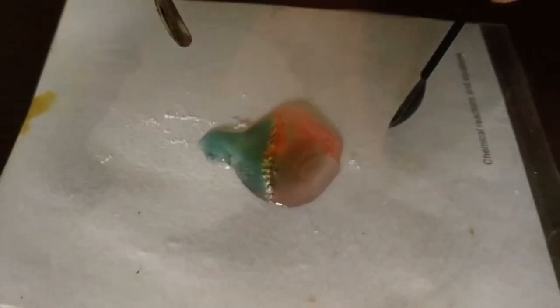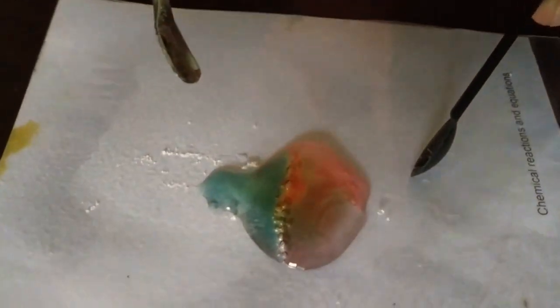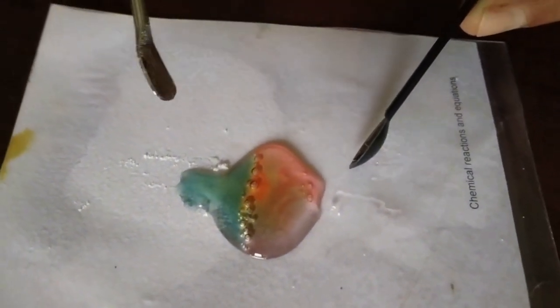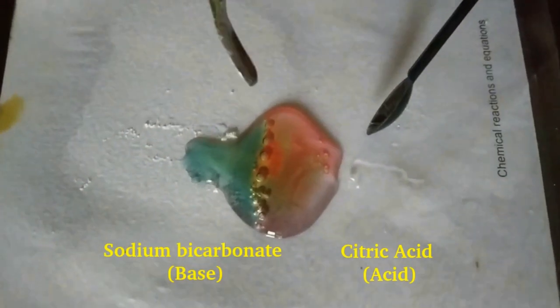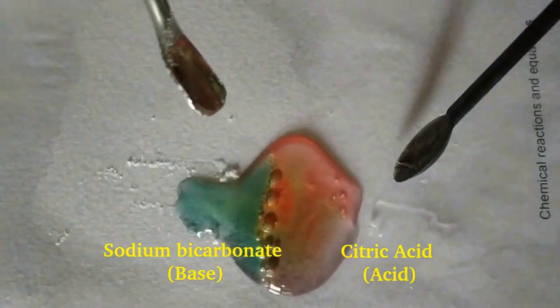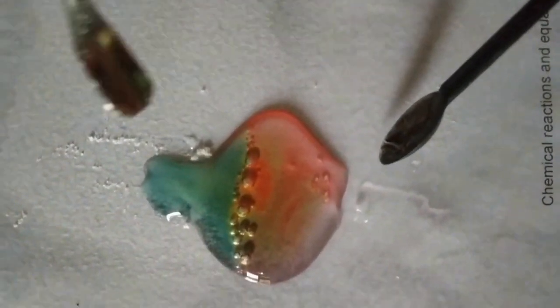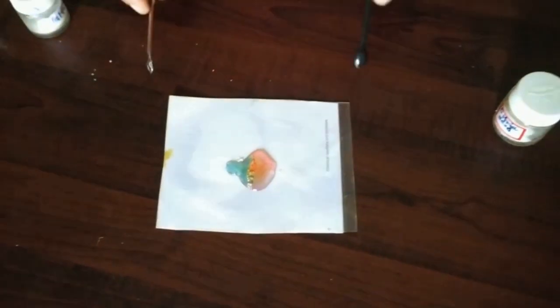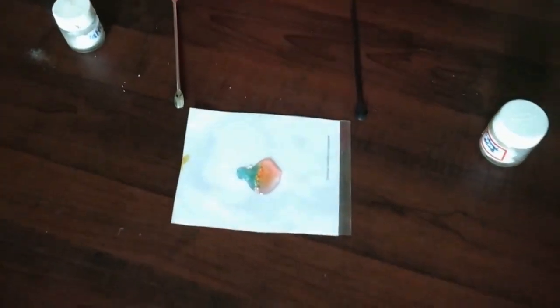So if you are carrying out this reaction in a test tube, you will not be able to show them the change in color, nor will you be able to show them the movement of ions, the site of the reaction. The moment you add the chemicals, the bubbles will be formed, the effervescence will be formed, and the gas will be released. This is a better way to carry out the reaction, and it is easy for cleaning purpose also.